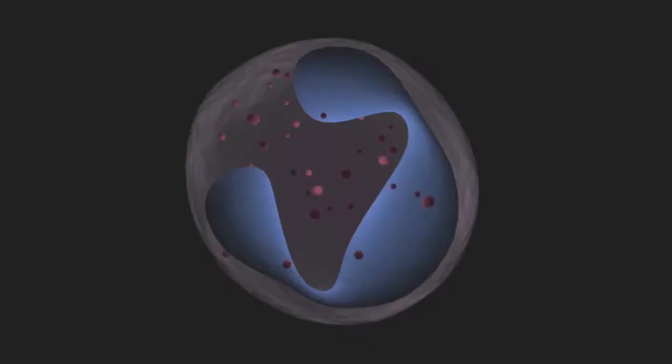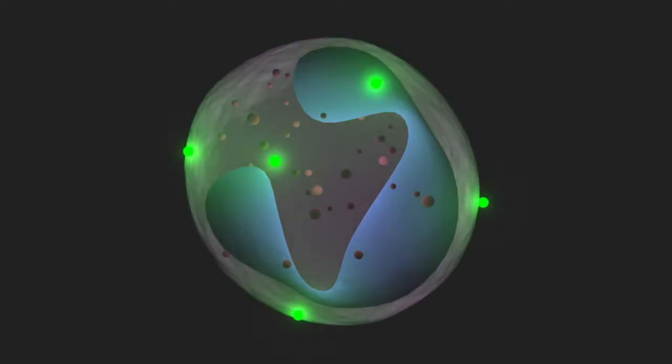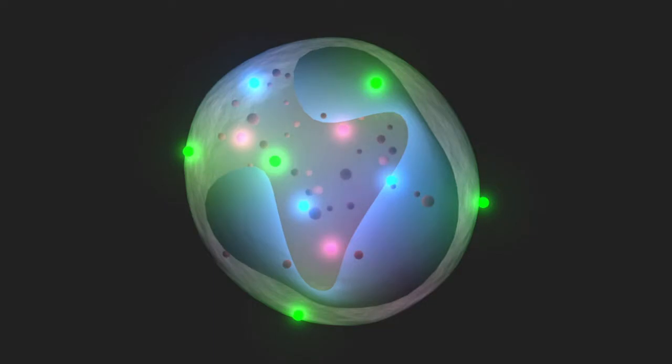In addition to analyzing a cell's size, shape, and complexity, a flow cytometer can also detect emitted light from excited fluorescent molecules, such as fluorescently labeled antibodies or fluorescent dyes or stains. For the rest of this animation, we will focus on the detection of fluorescent signal by the flow cytometer. For more information about fluorescence, please see the fluorescence animation.